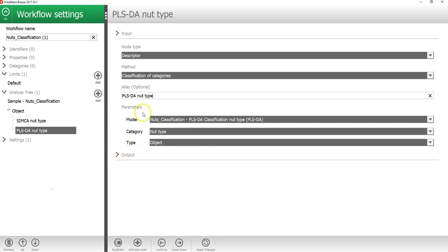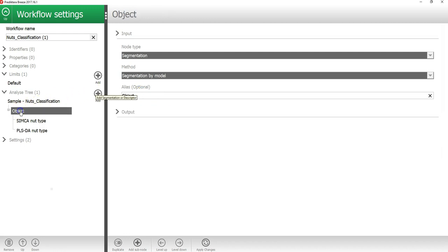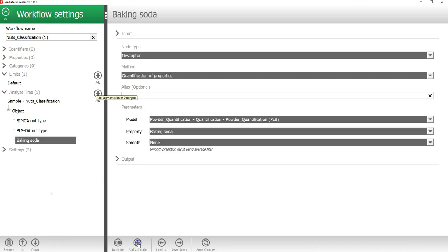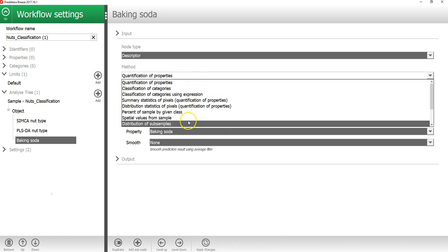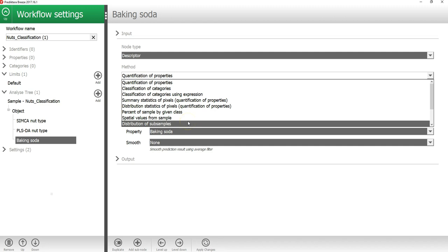In Breeze, you can add many different types of descriptors to your workflow. If I click on the object level and then press add sub node down here, I can add a new descriptor. In the method drop down menu, I can select a number of different descriptors that are available in Breeze.